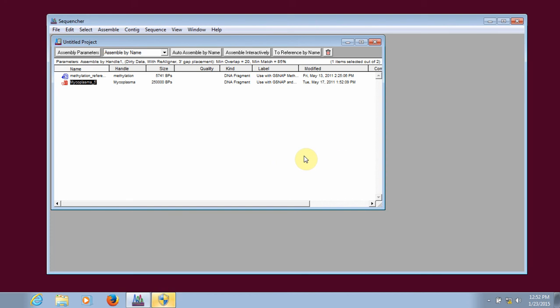If you recall, when using Sanger data, you import all of your reads into the project window. With NGS data, the only sequences that you import into your project window are the reference sequences.